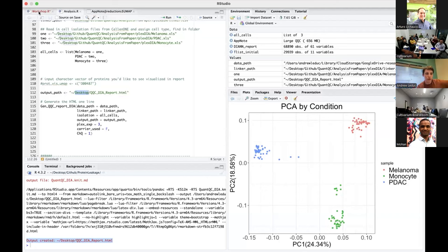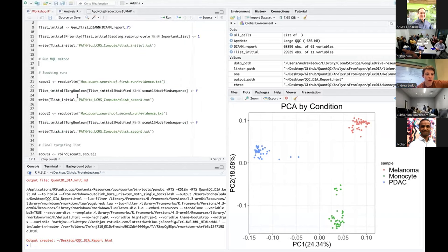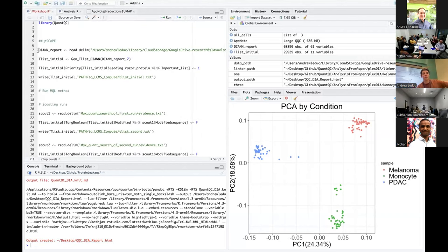So the targeting list is something that we're going to eventually load into MaxQuant. I haven't got into this. I will in a little bit.